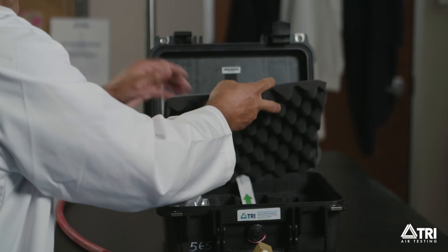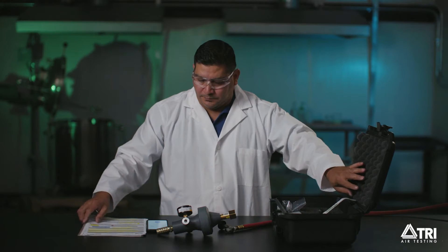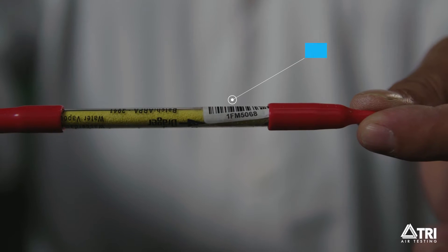While that is happening, locate the datasheets behind the foam lid in your test kit. Grab your datasheet and your moisture tube. Record the moisture tube number located here under section Moisture Sample Data.